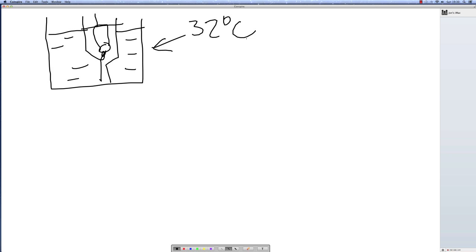Why do we set it to 32? This is a question that you need to think about. If you think about it for a second, see if you can come up with an answer. The body temperature of a guinea pig is 37. And as we have been talking about in the autonomic lectures, we were talking about the motility of the gastrointestinal tract, and we were talking about peristalsis. So what do you think happens at 37 degrees C? Yes, that's right, peristalsis.